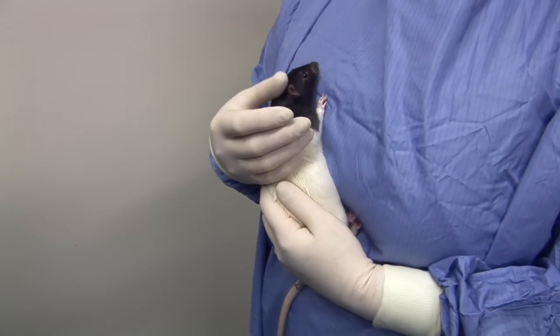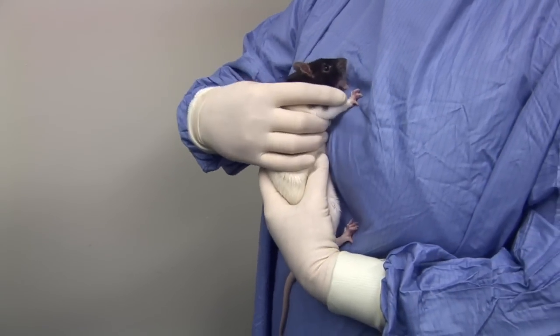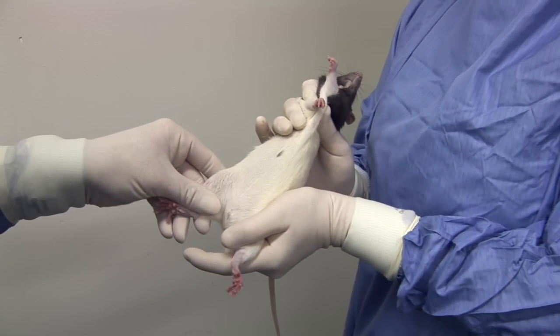To carry out an intraperitoneal injection, adjust your grip around the rat's shoulders so that your thumb and forefinger push one or both of the rat's legs forwards. The rat's hindquarters are supported using your other hand and the left hind leg restrained between your thumb and forefinger. An assistant who will carry out the injection holds the animal's right leg and extends it gently.